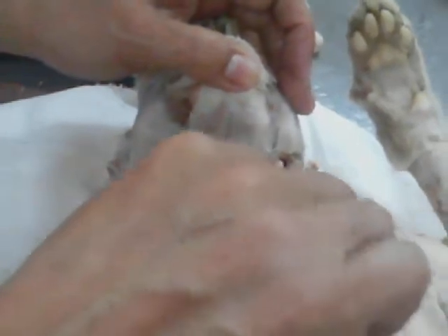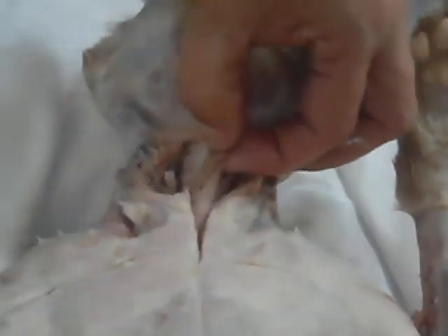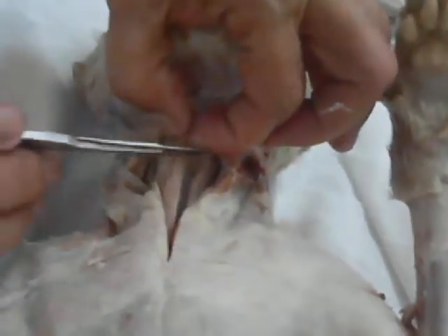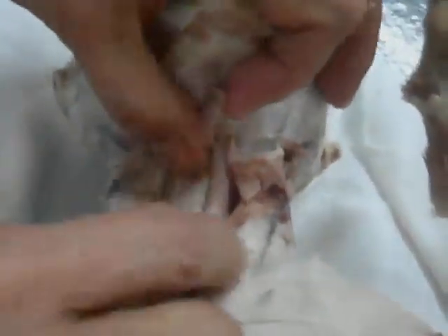And you are supposed — this is sternohyoid. Sternohyoid, sternothyroid, hyoid. So, you cut now the belly of the sternohyoid, and you are going to see two internal muscles.